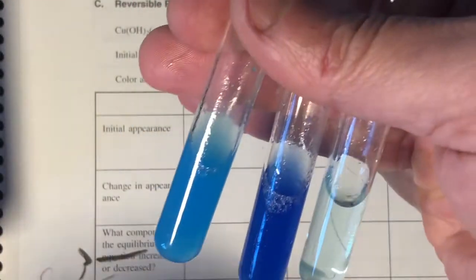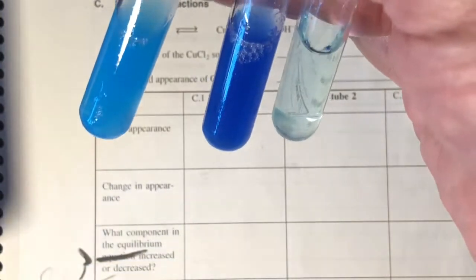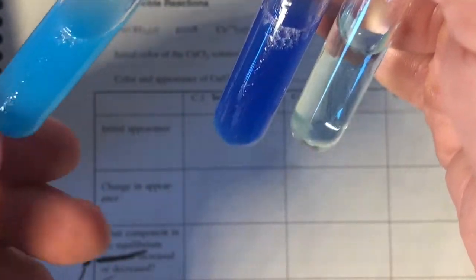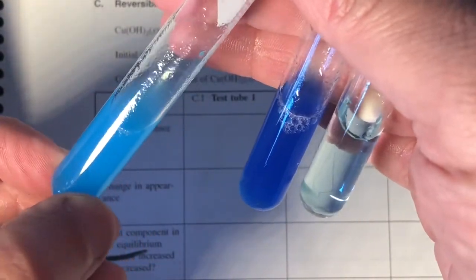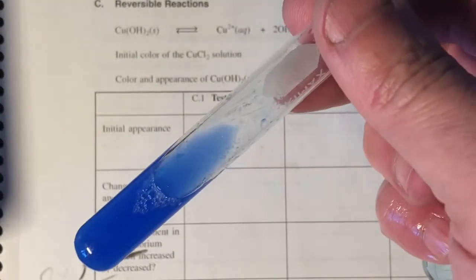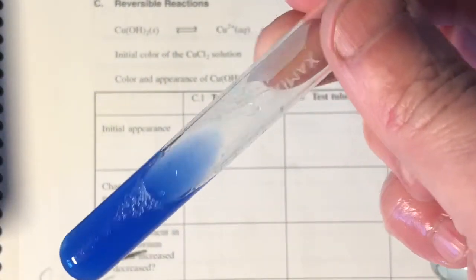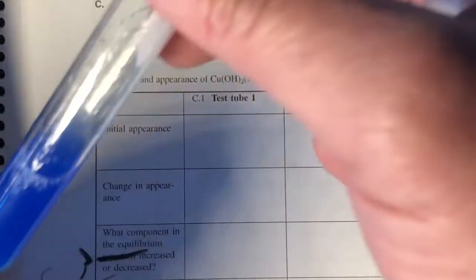All right, so we saw an obvious change in the color. The copper hydroxide test tube got bluer, it looks like, but what's important here is that it's more cloudy. That's really obvious in the video here, but it's got more of that opacity of the solid. The ammonia one got much brighter blue, but the difference here is that this is actually fairly clear. A little bit of cloudiness still, but it's got less of the copper hydroxide.